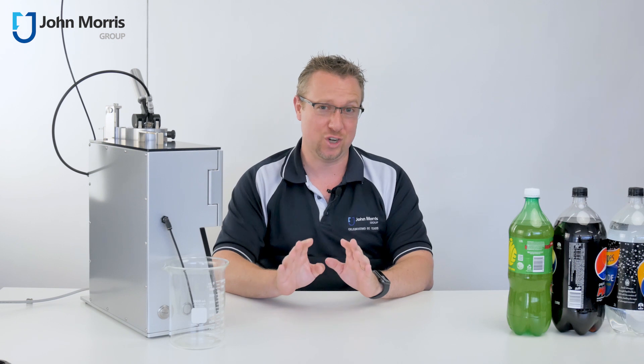So what's it all about? Well, the Koo-Ree is the perfect solution for looking at carbonation or CO2 and Brix in a carbonated beverage. And you're going to love this product — it's just so cute, I almost want to hug it.